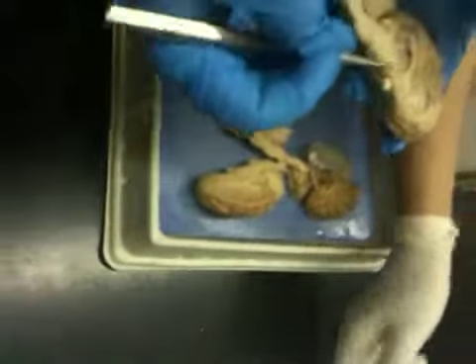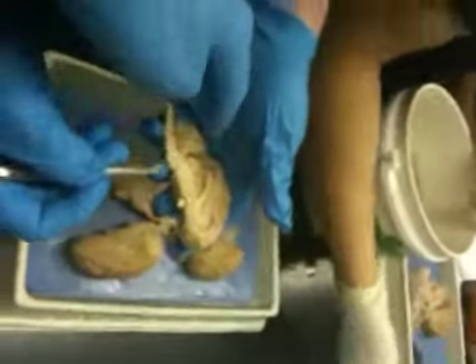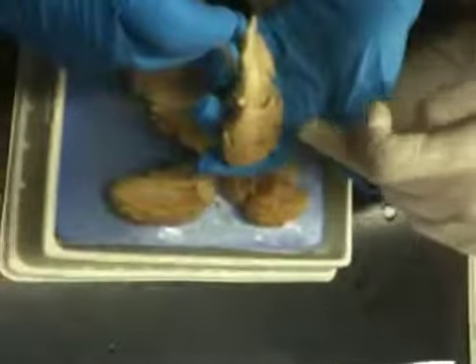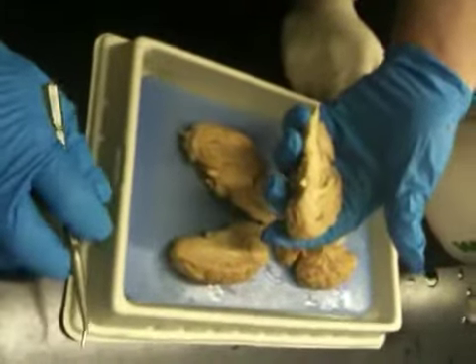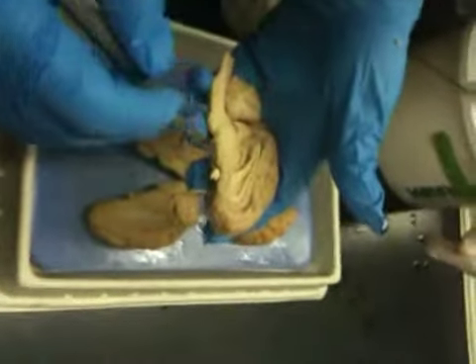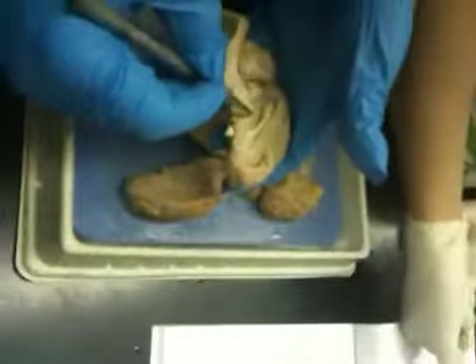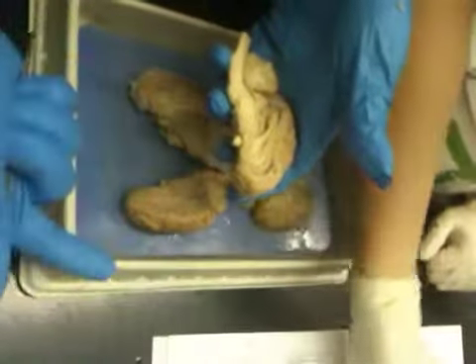The hypothalamus is just more of this little part here. And where's the third ventricle? This is the aqueduct. Where was the third ventricle? The ventricle is between the optic lobes and cerebral hemisphere. Oh, it's right here. Third ventricle, same as before. It's the same part of the hypothalamus. So the thalamus, sorry. Is it this little hole right here? That's the massa intermedia. This right here, and underneath it, it's the thalamus and the third ventricle.